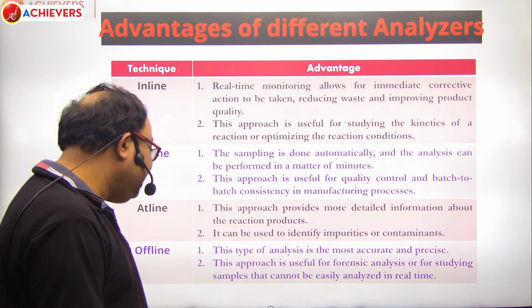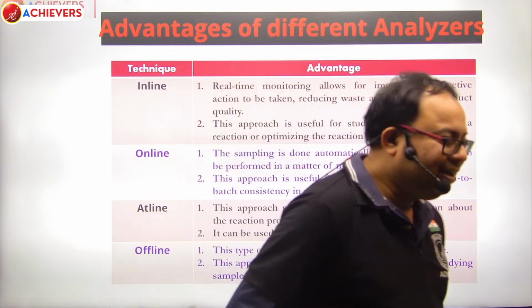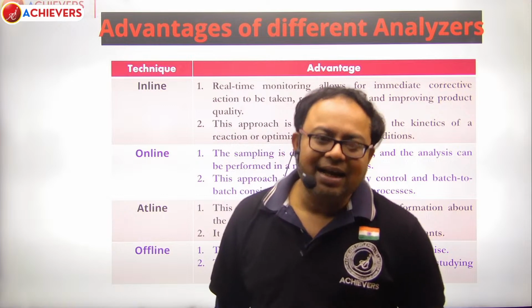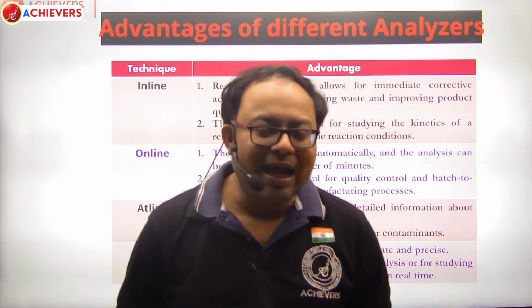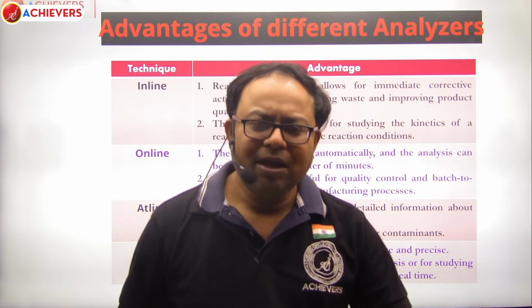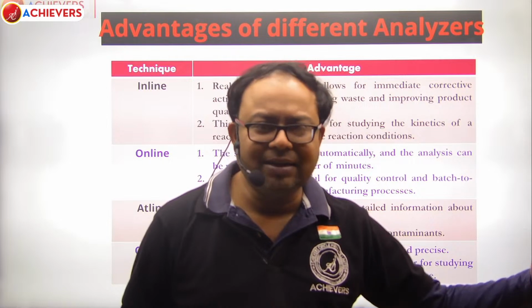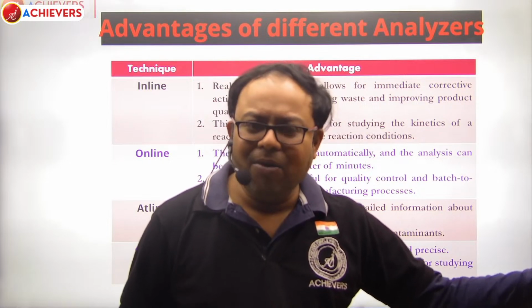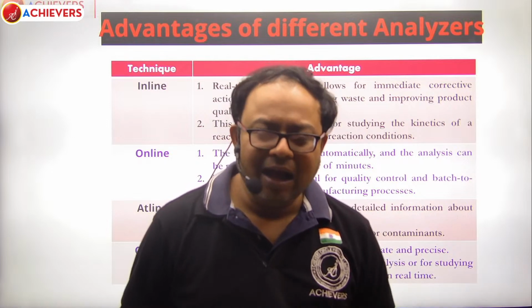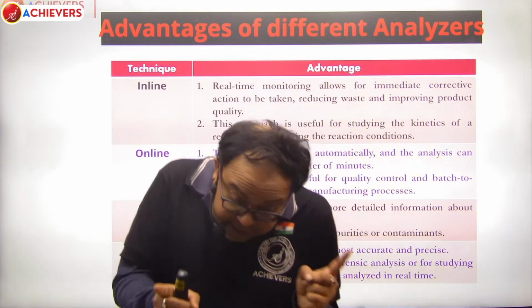The final advantage for offline analysis is this approach is useful for forensic analysis or for studying samples that cannot be easily analyzed in real time. Very important, forensic analysis. In forensic analysis, you don't have real time results. Suppose a crime has been committed in a particular site, and now you don't have the real time data of that, but you want very precise data.